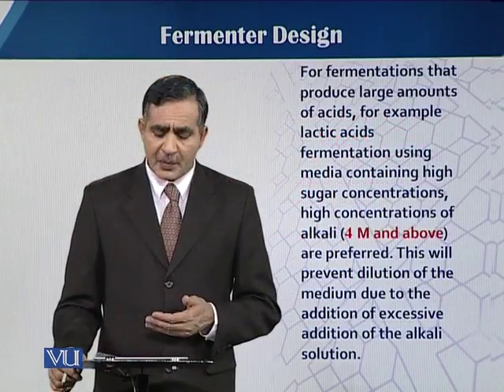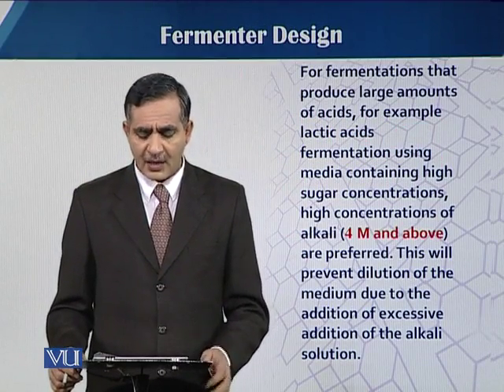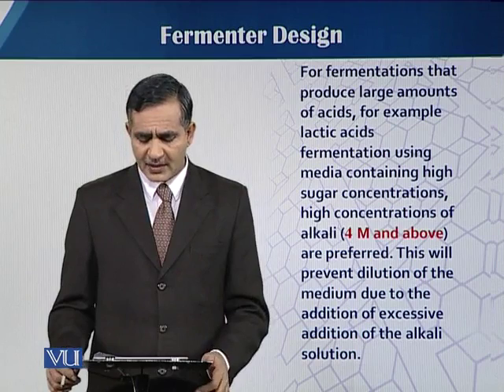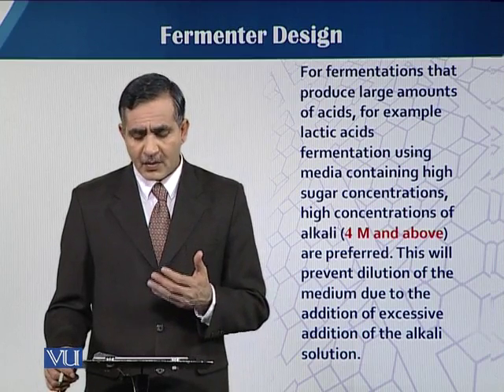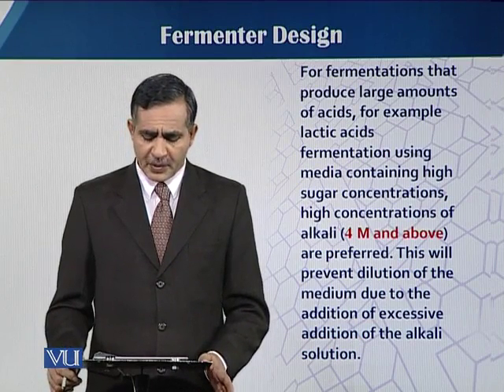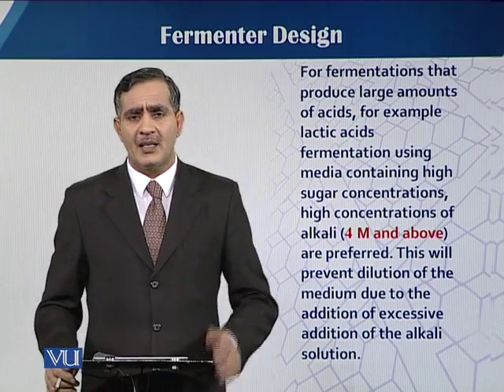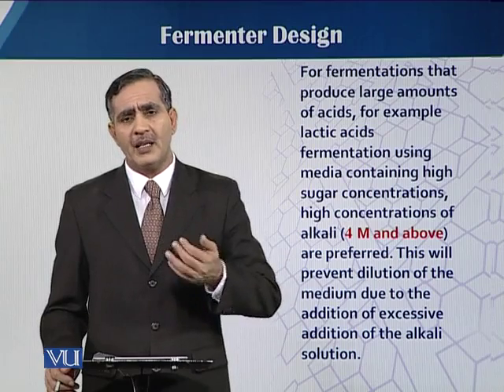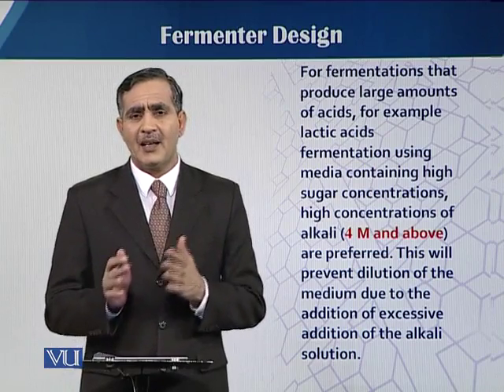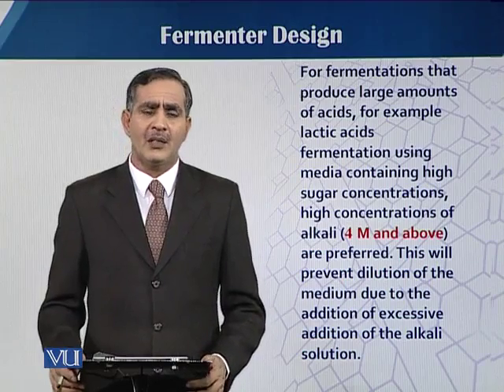For fermentations that produce a large amount of acids, for example lactic acid fermentation, some specific molarity is needed. So alkali that is 4 molar and above is preferred. This will prevent the dilution of the medium, because when we use a diluted neutralizing agent, it can raise the volume of the medium, which can affect the kinetic parameters. So we should use a specific strength and concentration of the acid or alkali agents which we use as a neutralizing agent.